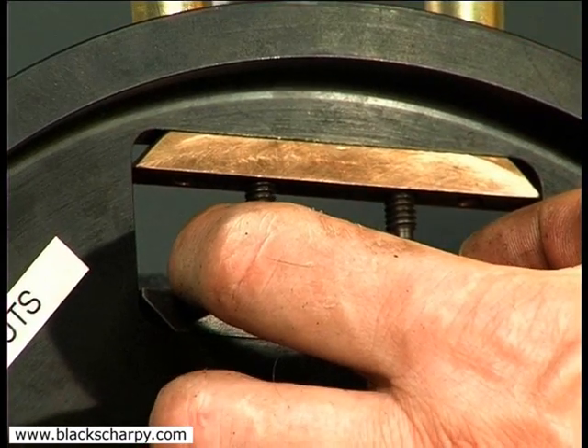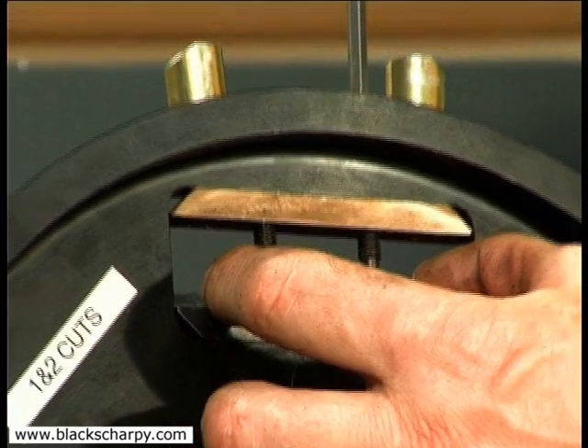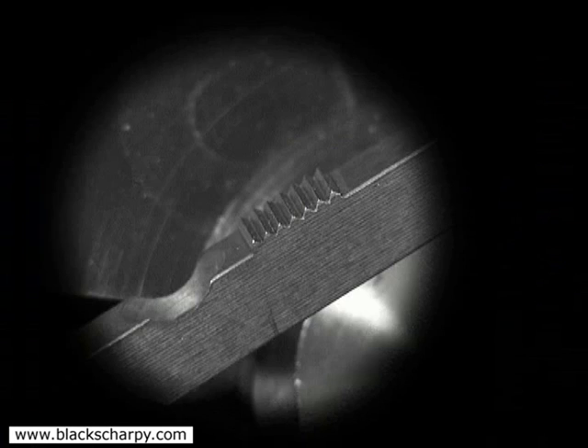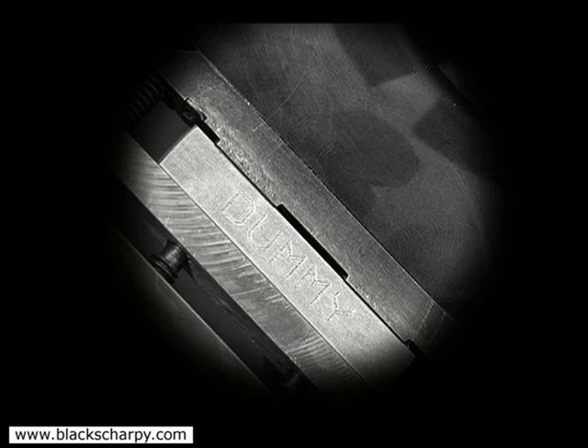The rotating fixture is set with two pockets to machine first and second cuts. These have a screw point clamp and serrated anvil, and two pockets set to machine third and fourth cuts. These have flat clamps and anvils.